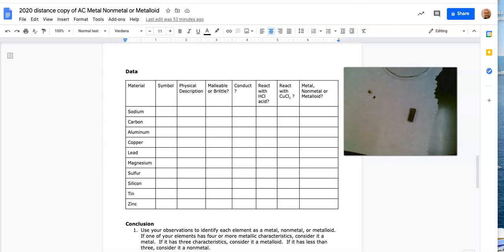When you think about carbon, you can think about things like graphite that's in a pencil, or charcoal that you might put on your grill. Those are all examples of pure carbon. Carbon can exist other ways too, like diamond is pure carbon. Just a different version of it. But the one that we've got here is just a black solid.